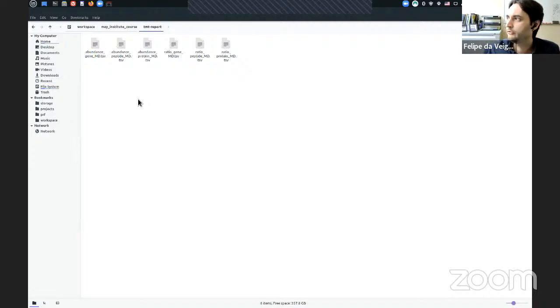You might ask, okay, which one should I use for my downstream analysis? We use the TMT-Integrator outputs when you are dealing with TMT or iTRAQ data because they are already normalized. But if you are trying to do something different, for example, if you don't want to use TMT-Integrator, or if you want to use MSstats TMT, you start with the MSstats table, which is not normalized.